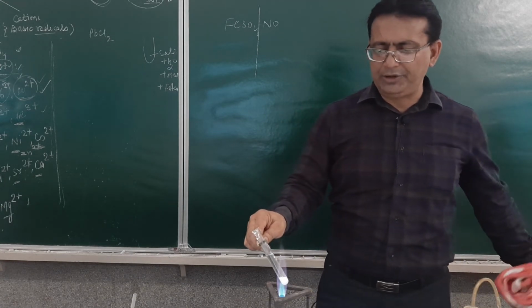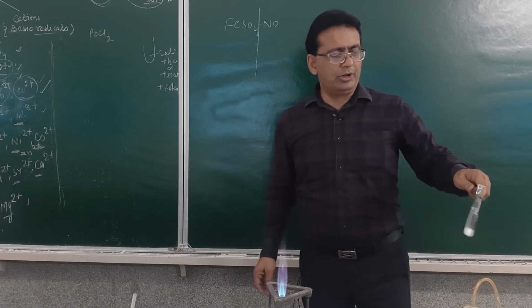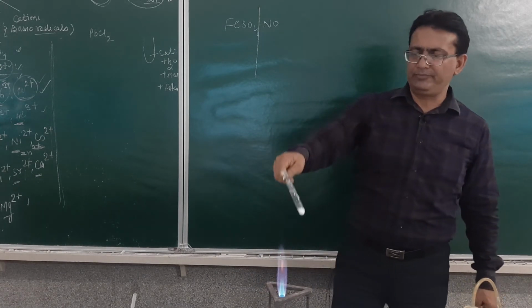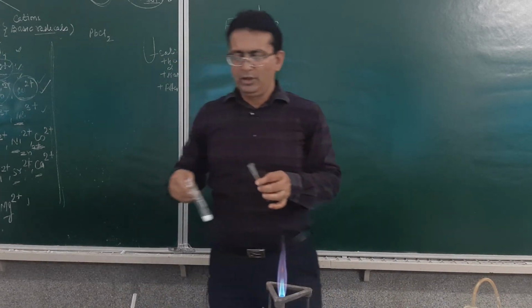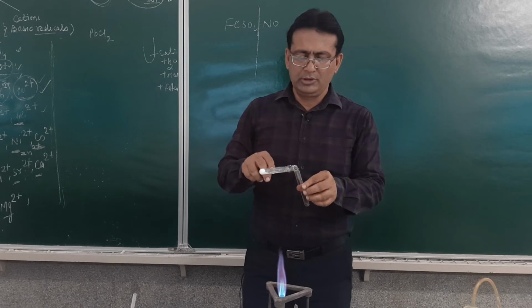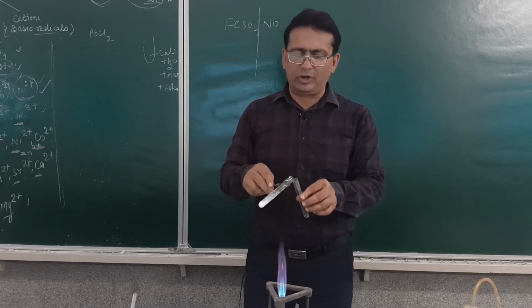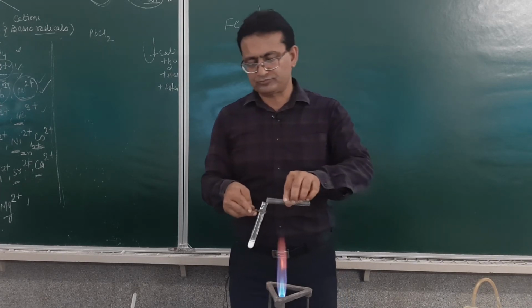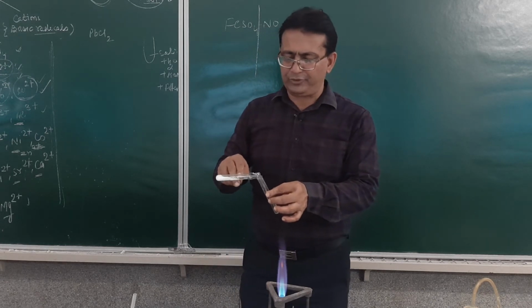Now, when it gets heated up, what you need to do is divide this solution into two parts. This is a solution of lead chloride. Divide the hot solution into two parts. To the first part, we will add potassium iodide. You may look at your study material also. The confirmatory test of lead is given. Divide the solution into two parts.